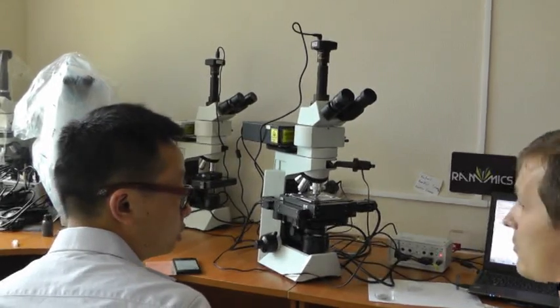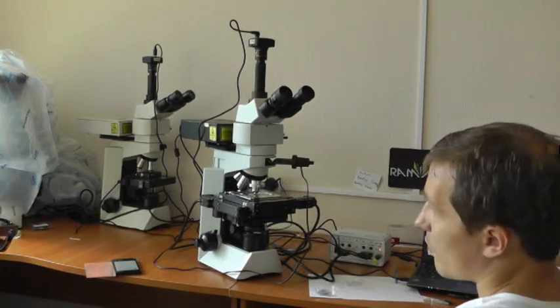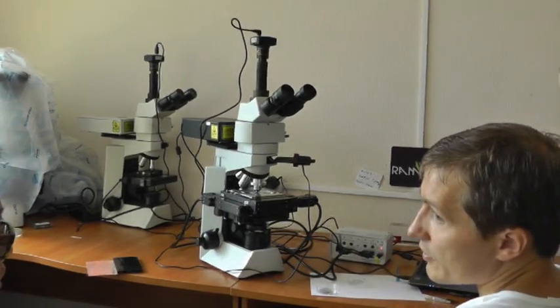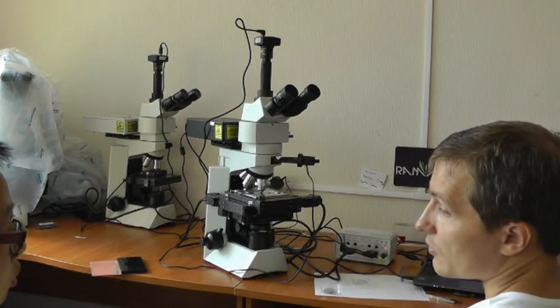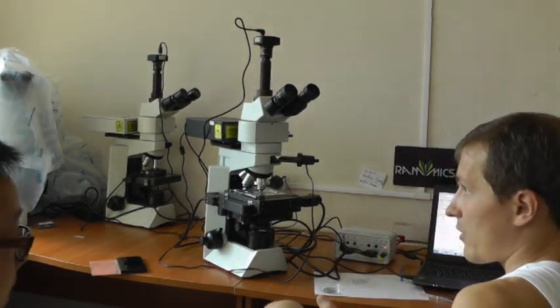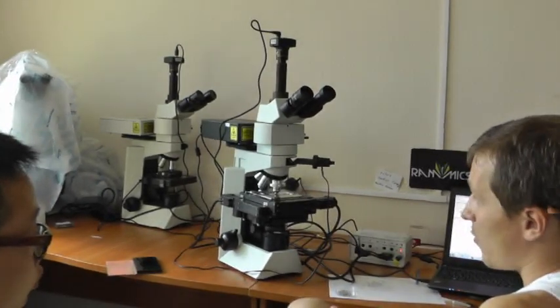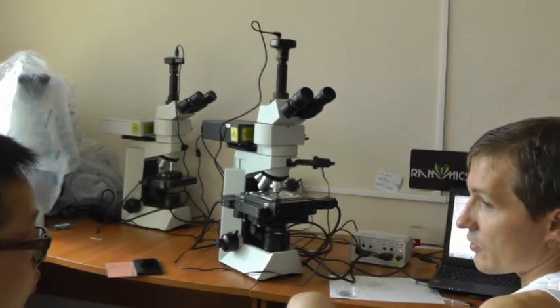But what is it used for? Why do we use a beam splitter? For lighting of a sample? You said that you've seen a microscope with a beam splitter that cannot be removed, but why did we use it?